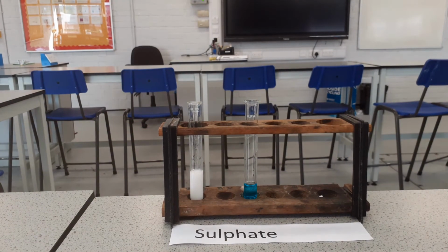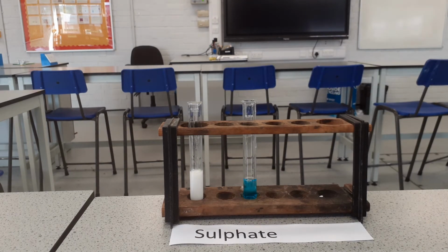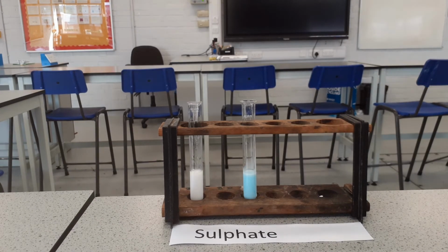So if I use a little bit of copper sulfate to show you again, there, and add barium chloride, so you will get this white precipitate. Now, precipitate is a solid. We leave that, it will fall to the bottom. Now, only sulfates will form a precipitate with barium chloride and hydrochloric acid. So that's why it's the test for sulfates.